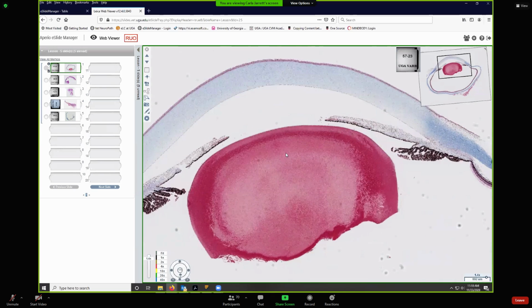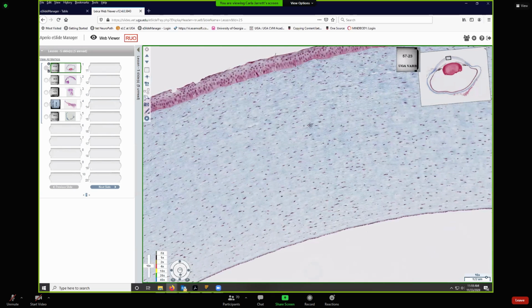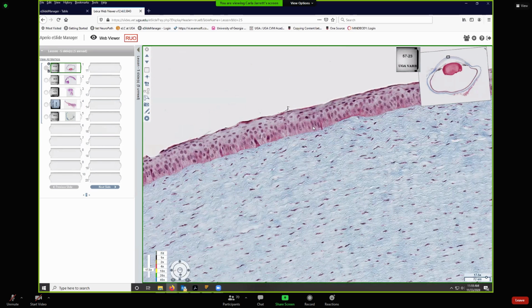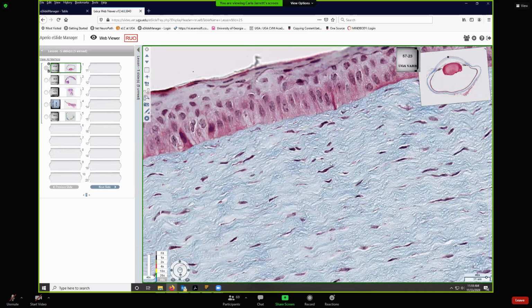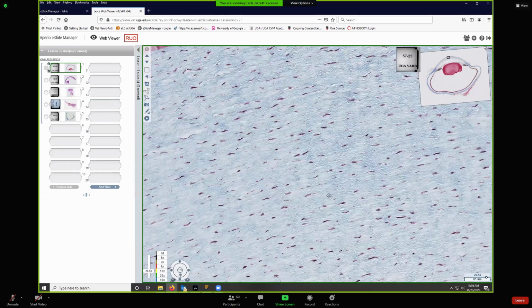Okay. Yep. So in the cornea, where do we have basement membranes? Well, this is an epithelium. Would you expect that to have a basement membrane under it? You betcha. There's always a basement membrane between an epithelium and its underlying connective tissue. I can think of one exception, but we won't go there. You'll learn about it in neuro.